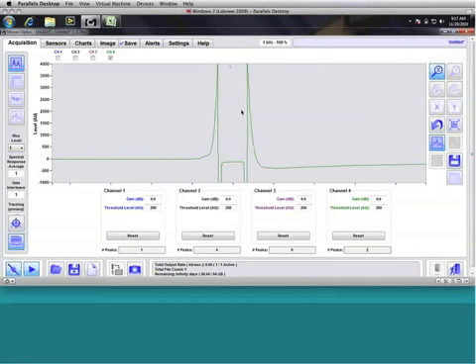Typically, what you will see is for a 90% reflectivity grating at a gain setting, here we are on channel 4 of 0, that it should come out to a level of about 3,000 counts, leaving you with a good signal-to-noise ratio and no saturation. However, if the gains are set higher than 0, then very frequently you may see a situation where the sensors are saturated. And so the way we're going to go about addressing that saturation in our setup is by adjusting the gain.